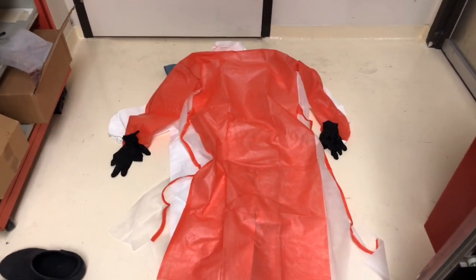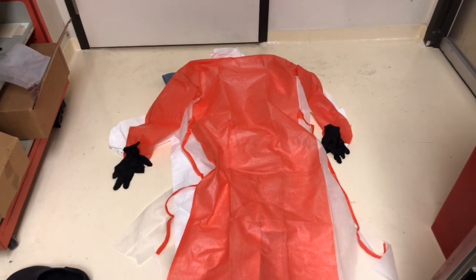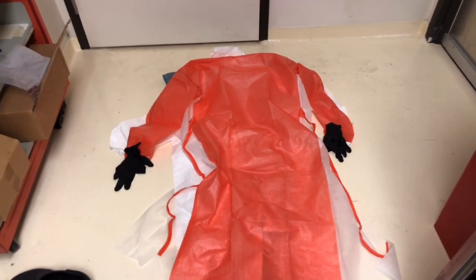But once again, we spray everything down with ethanol. So this is a really good way for us to disinfect ourselves. Ethanol is essentially what goes into the hand sanitizers that you should be using. So they're about 70% alcohol, and we use 70% ethanol as a way to disinfect ourselves before we walk out of the BSL-3. So we essentially take a big old shower using spray bottles.